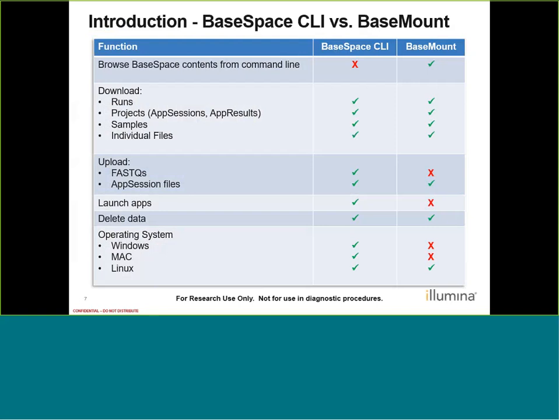Let's briefly compare CLI and BaseMount. The ability to browse a BaseSpace account through the command line is exclusive to BaseMount — CLI does not provide this functionality. However, with CLI, we can perform actions like listing our runs, projects, and datasets, which we'll see in the demos, but it's not quite the same as being able to browse our accounts or account contents like we can with BaseMount.